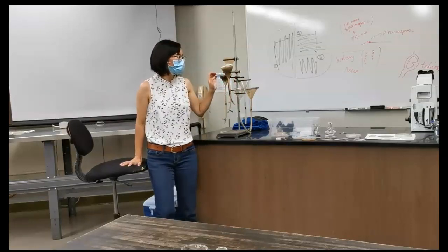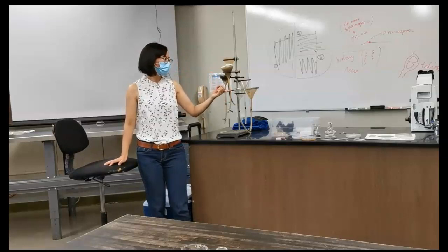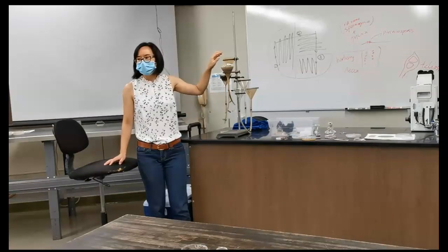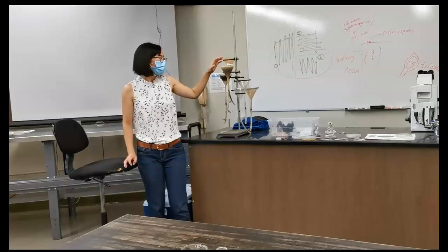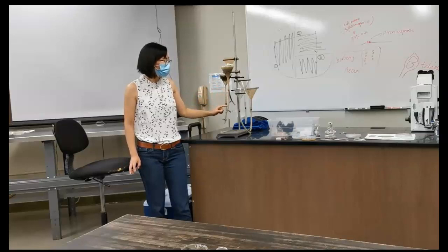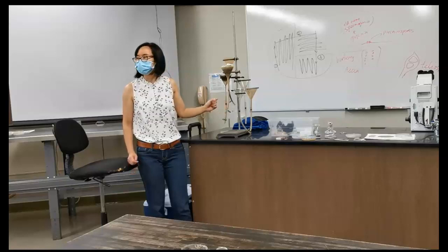So basically, you have a funnel, plastic funnel or glass funnel, and then you have a wire mesh here to support 2 layers of tissue, Kleenex tissue, wrapping some soil, and then have a flexible tubing connect to the funnel with clamp, close the tube.